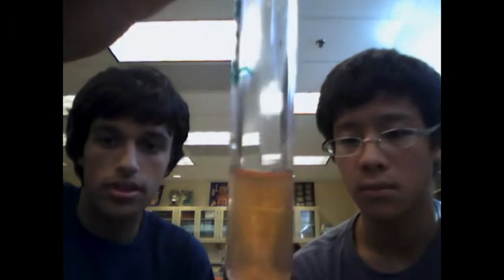Take some notes. Notice the color. That color comes from the benzoquinone. This dark brown color comes from the benzoquinone, which is the product. You see, as the oxygen reacted with the catechol, the enzyme came in and produced that.